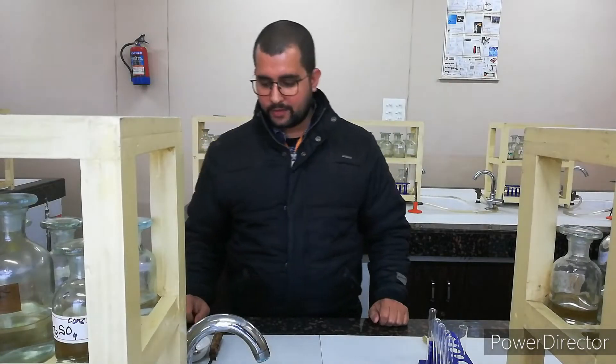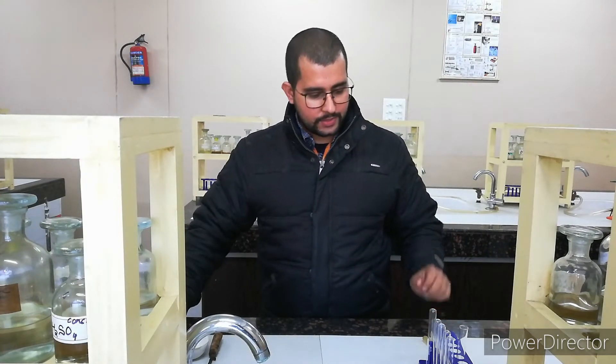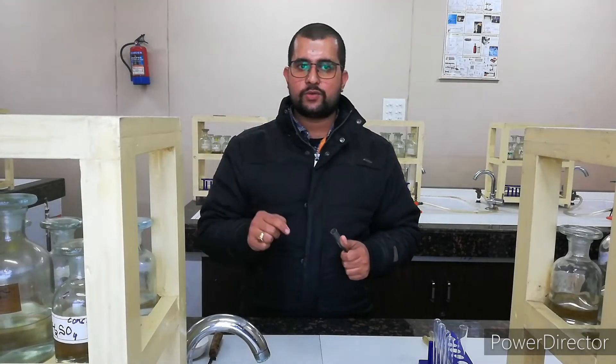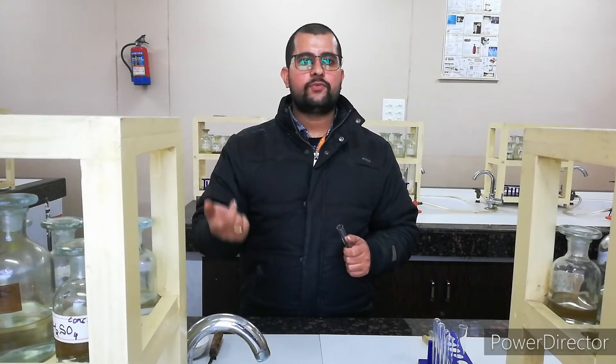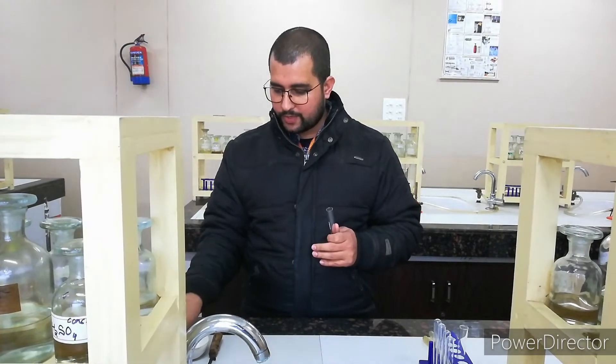Hello students. I am here with another sample to find out one cation and one anion. For proceeding, we will start first with the anion test, and for that we will do it very first with the dilute H₂SO₄ and observe what is happening here. Then we will proceed for the concentrated H₂SO₄, and if we still don't get anything, we will move for the sulphate and phosphate test.